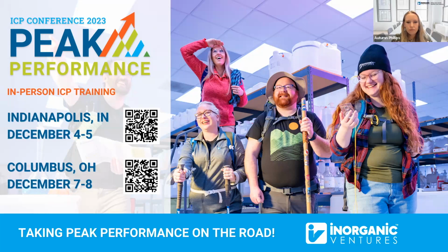Okay. All right, and then the next question is, I have noticed that Inorganic Ventures indicates to avoid any type of glass in sample preparation for lead. Why is this the case, and how trace can you get before this becomes an issue? I can answer that. So a lot of times the reason that we avoid packaging in glass is just because of the contamination issues.